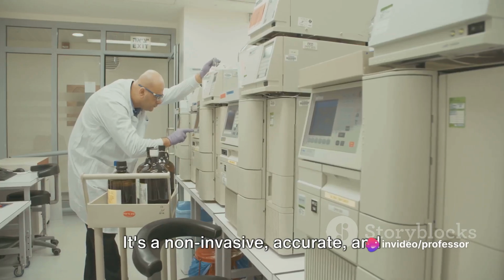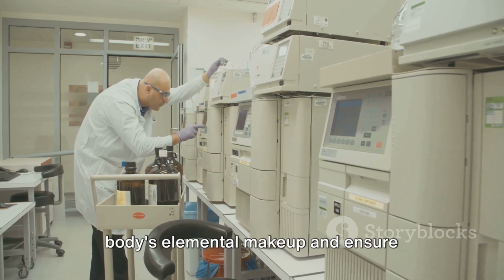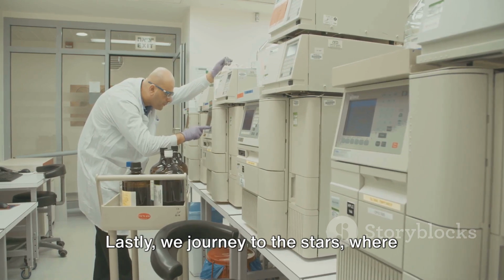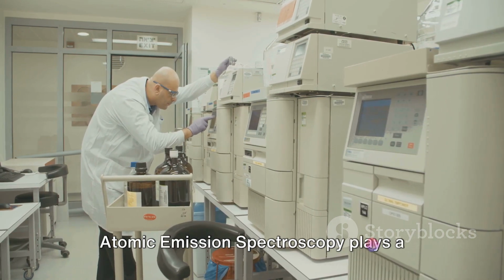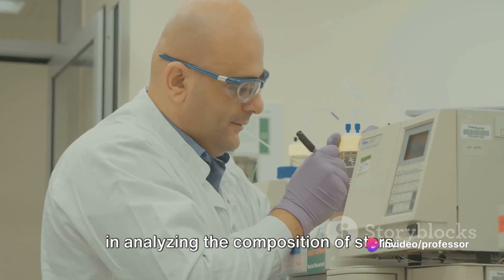It's a non-invasive, accurate, and efficient way to get a glimpse into our body's elemental makeup and ensure everything is in check. Lastly, we journey to the stars, where atomic emission spectroscopy plays a crucial part in astrophysics, especially in analyzing the composition of stars.